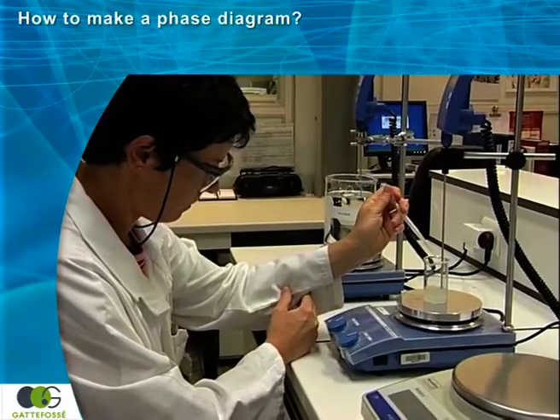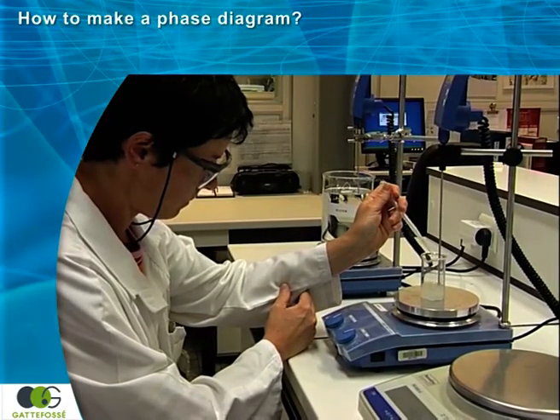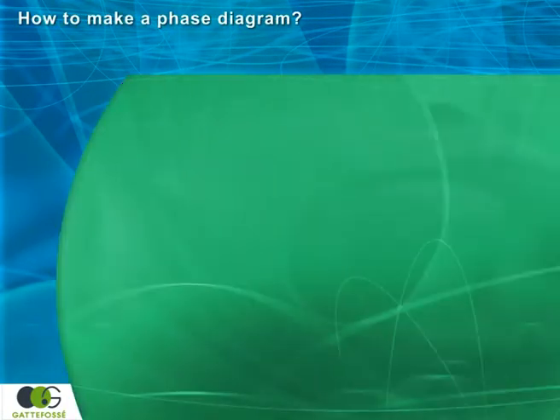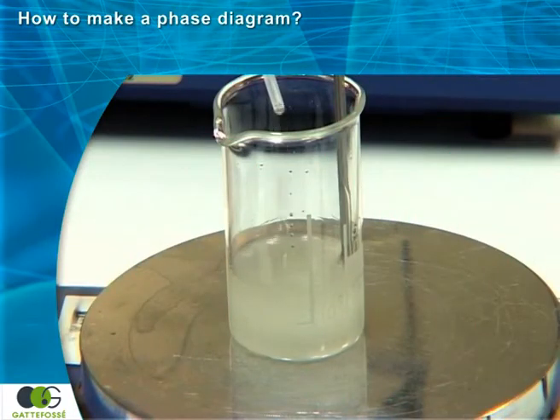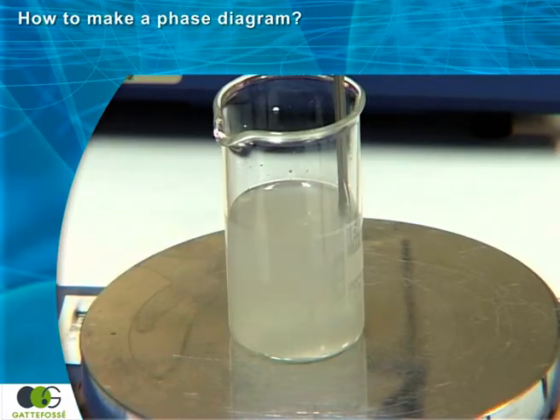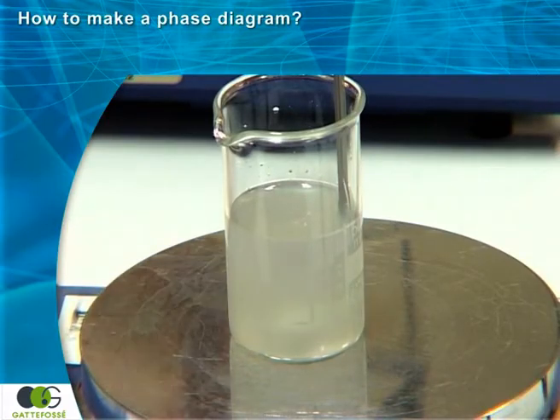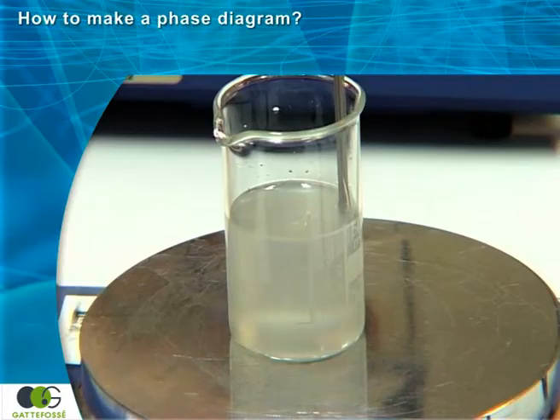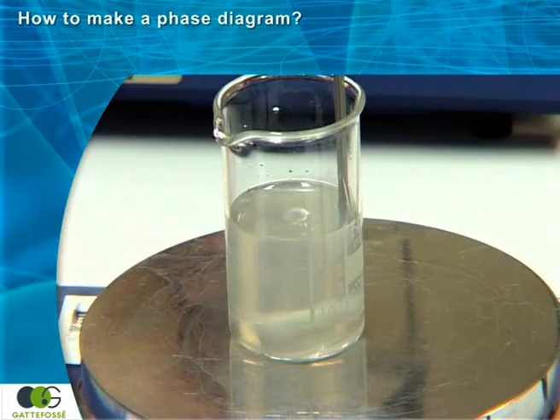The titration is then continued, drop by drop, until the appearance changes again. The formula becomes transparent, which means it has entered a micro-emulsion phase.